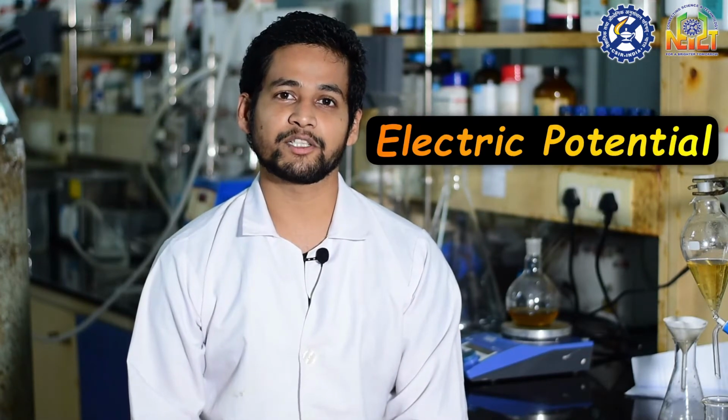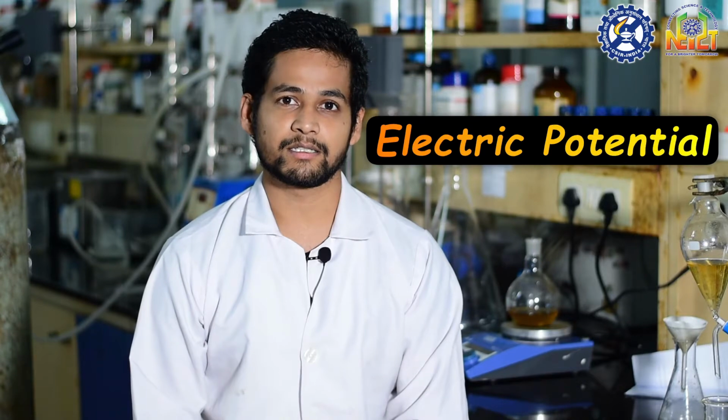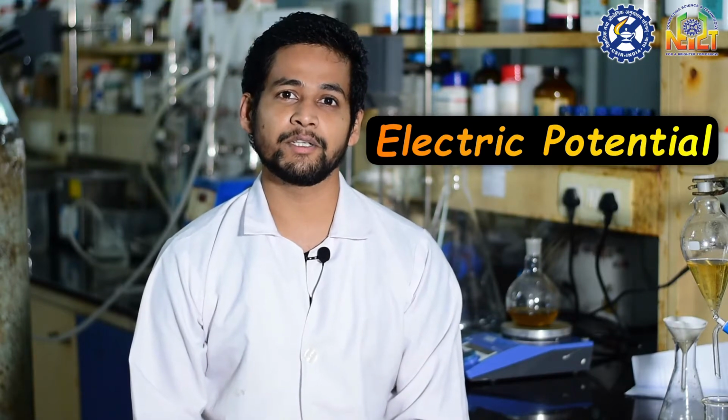Zeta potential is the scientific term for electric potential in colloidal dispersions. It is the potential difference between the dispersion medium and the stationary layers of fluid attached to the dispersed particles.